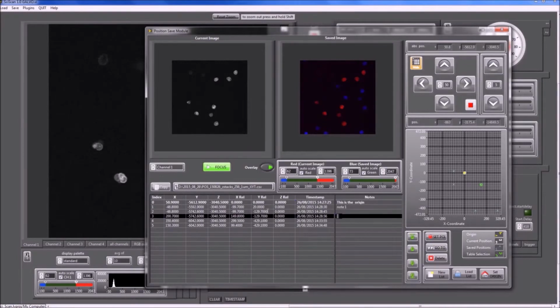To navigate to the positions that you want to go to, you could either click on the buttons for up, down, or click on the position you want to go, or you could use your keyboard, the up key, the down key, or you could go directly to home, to end, and so on.